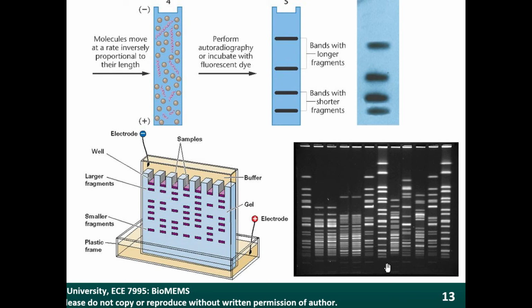Okay, and the position of these bands tells you the size of the fragment, and the intensity of the band tells you how much of it you have. So that on its own can be used. It's kind of a workhorse technology in a life sciences lab. It's even used in a forensics lab.